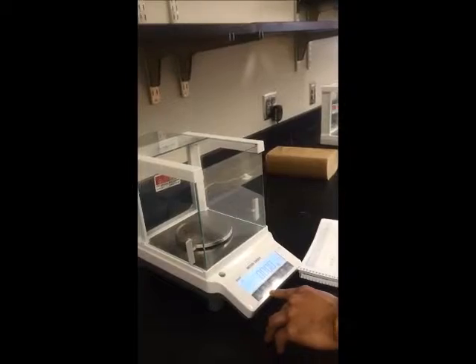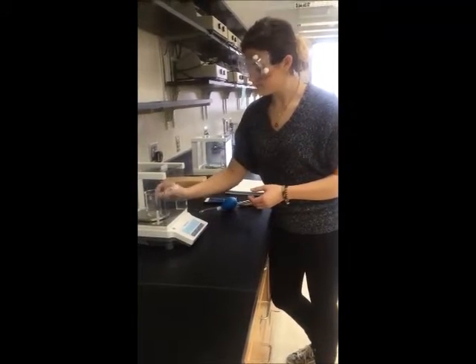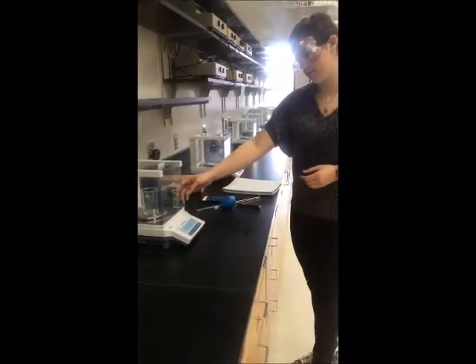First, tare the balance to 0, then record the mass of the empty beaker. Remember to record all digits on the screen.